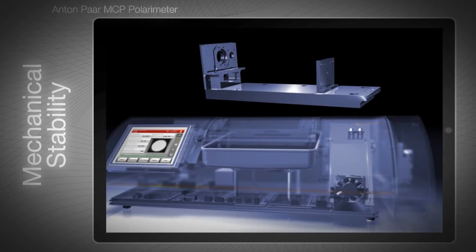The optical bench is the base on which all the optical components are mounted. This central part should not be subject to compromise. MCP's optical bench is machined from one solid block of aluminum and fixed on flexible mounts. It doesn't ever bend, twist, or pull out of shape. MCP delivers stable measurement values based on the sturdy grounding of this block.